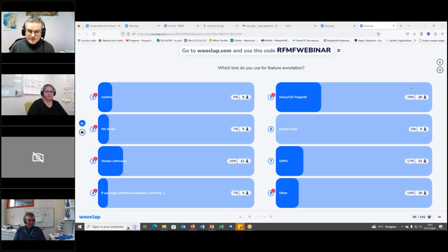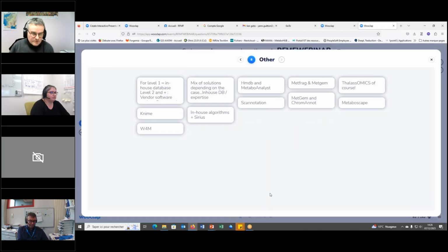It's still good to have your input. So here we have SIRIUS, CSI:FingerID in front, then vendor software and GNPS. Okay, great. Perfect. A lot of others are coming. Okay, good. So I will just stop there and have a look at the others.